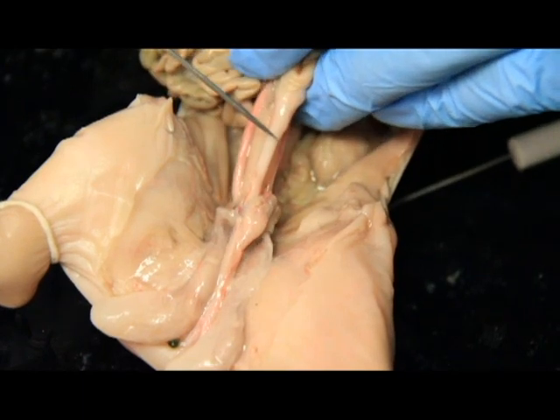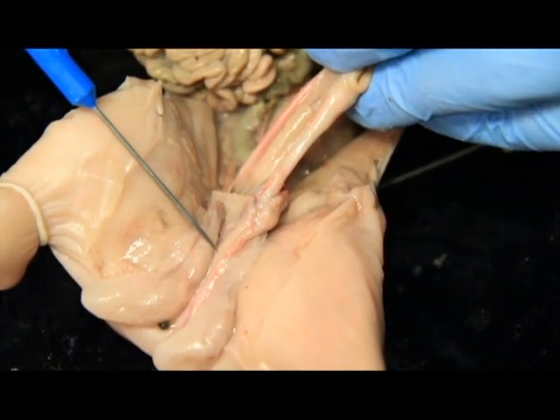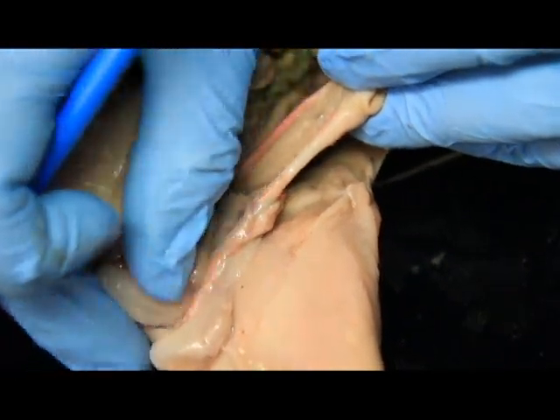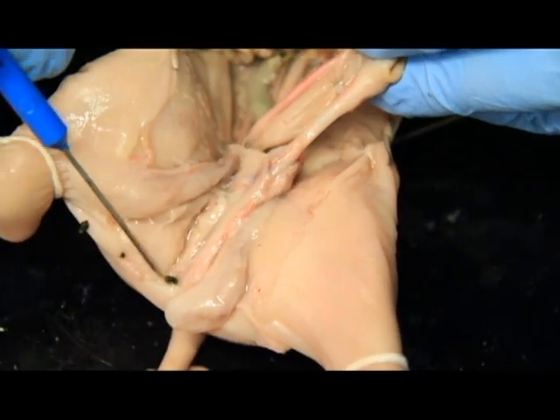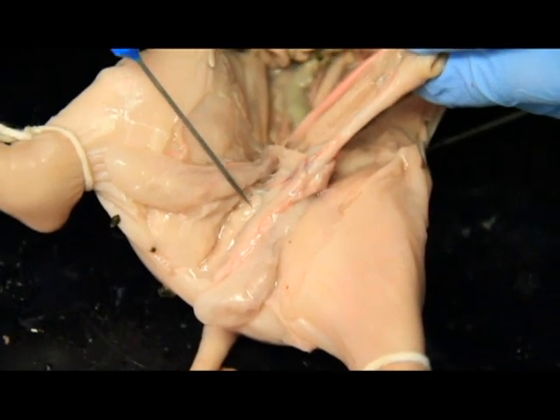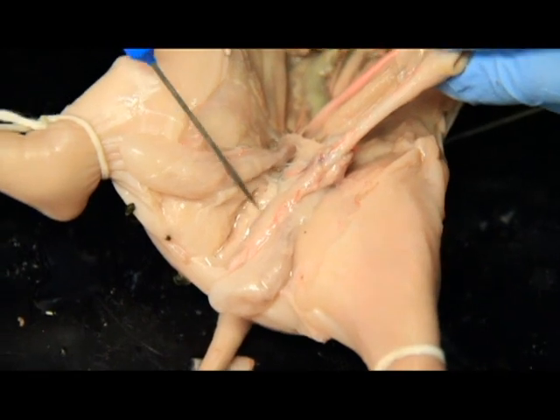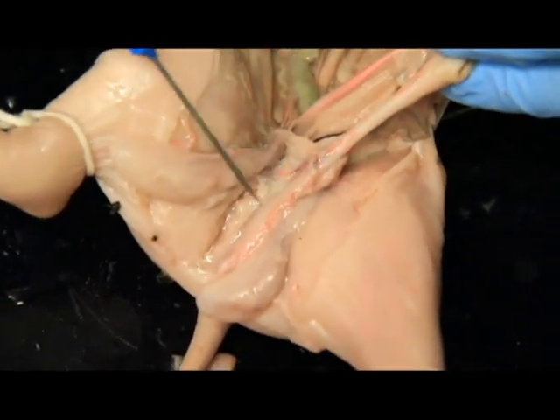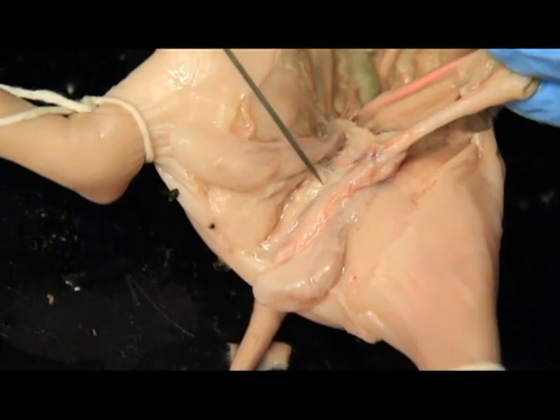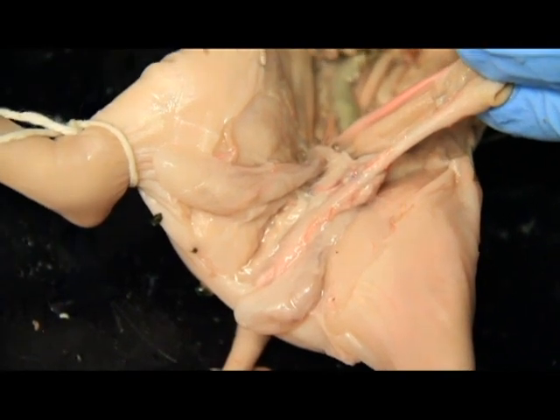Right off the penis. So then when this comes down and actually does a 180, there's going to be a small tube that connects this to the urinary bladder. That's going to be your urethra. So mine is actually covered right here. And if I were to cut away all this material in here, right about here, you should see this little tube that kind of does this 180 and starts going down here and then goes flip and goes whoop down in here. So you can't exactly see it. We'd have to dig a little bit deeper, but if you follow along your diagram, you should be able to tell what I'm talking about. And that is the urethra, again, going right up here to the urinary bladder.